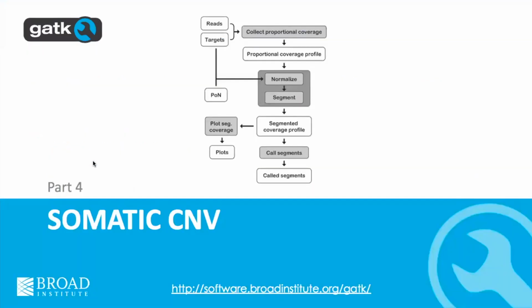So that's for the short variants, those are the main principles that are going to come into play, and we'll go over the details on Thursday. There are a lot of interesting details of how you do the filtering and how you evaluate the cross-sample contamination and take that into account. We'll talk about that on Thursday in painful detail.